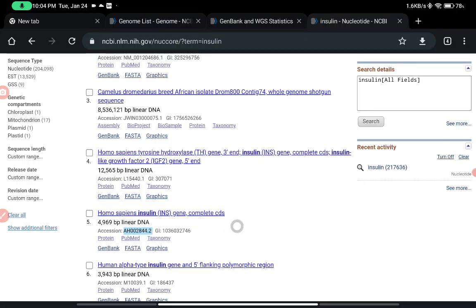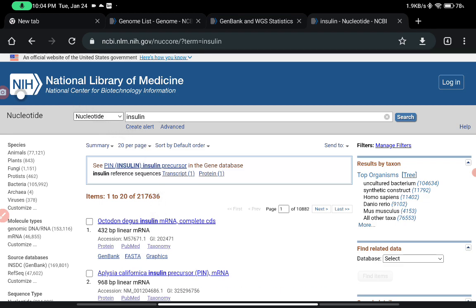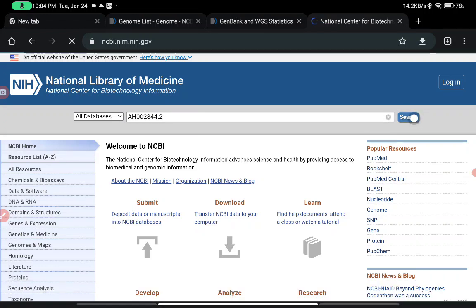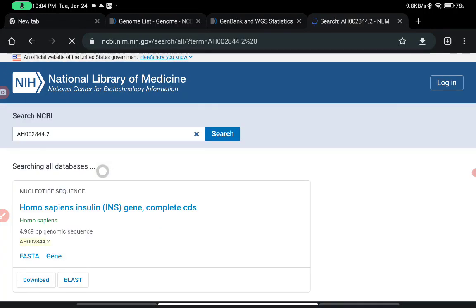There is a third option by which we can search our result — if you already know the accession number. As mentioned in a previous presentation, in the case of GenBank and FASTA files, a unique common number is given to each entry: the accession number. We can simply write that particular accession number into the search bar, or paste it, and directly get our sequence of interest.